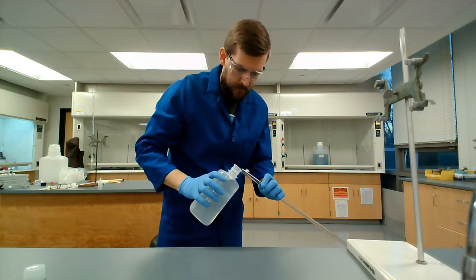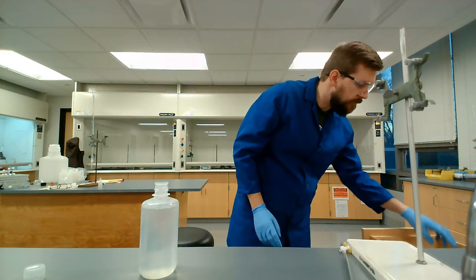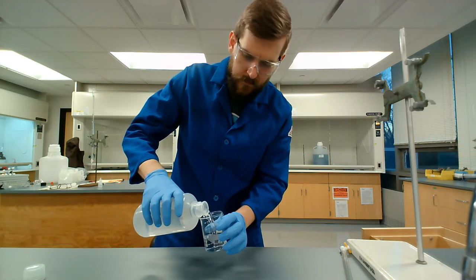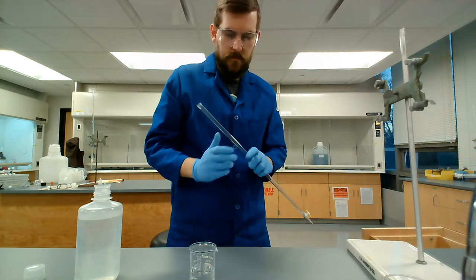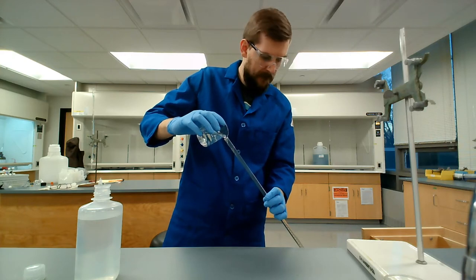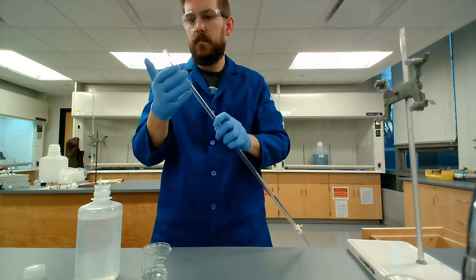So, I was about to fill this thing up, but I realized it's going to be a struggle to pour out of this giant bottle, so I'm going to instead grab a beaker, pour some of the sodium hydroxide solution in this clean, dry beaker, and now using the little spout at the top of the beaker will make pouring into this buret way easier and way less hazardous, right? So I'm only pouring, I don't know, 5 or so inches, a hand width, into this buret.